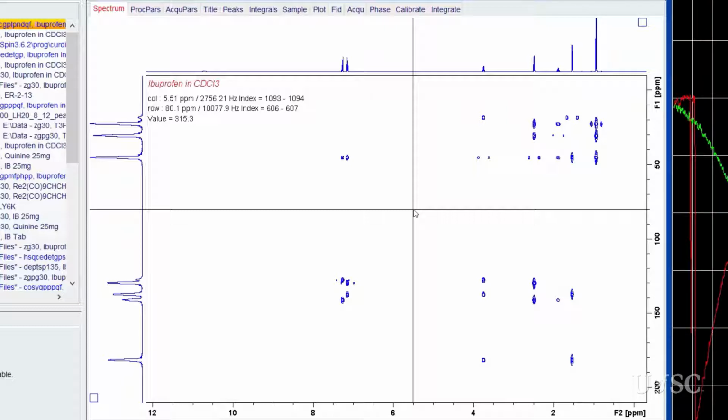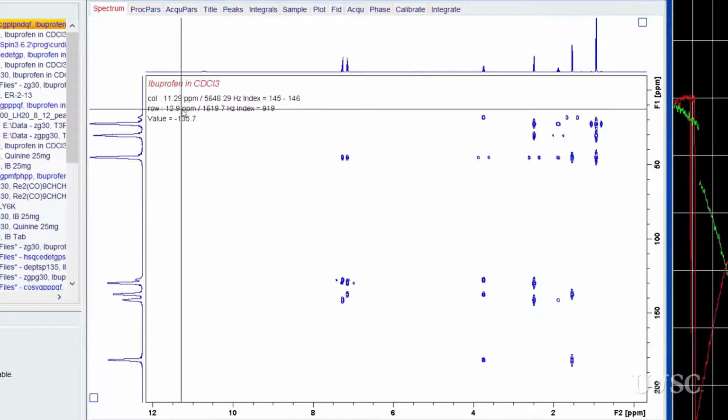The projection along the F1 axis is the true shadow projection from the HMBC data. Its resolution is limited by the number of T1 increments, which is 128 by default for this experiment. Since the C13 window includes the 220 ppm chemical shift range, this comes out to about 2 ppm per data point. Also, the HMBC experiments collect magnitude mode datasets, and this will make the F1 resolution even poorer.